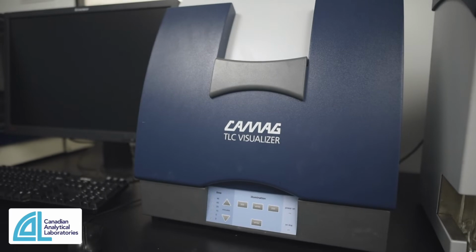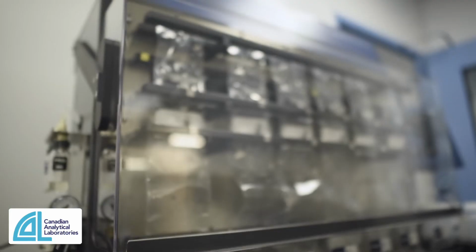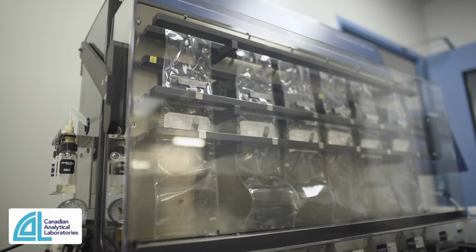We do our allergen testing on this side, so gluten, 16 types of allergens that we do at Cal, all through PCR type of assays. We have a dietary fiber machine here, which helps us quantitate fiber.